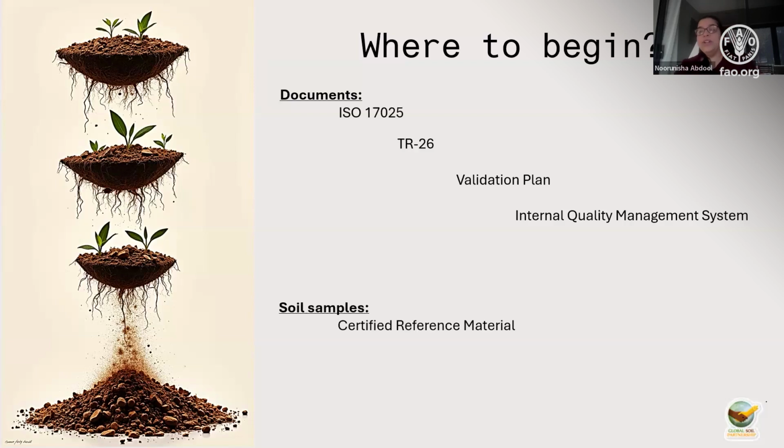Then, of course, you're going to need soil samples. Now, we touched on this a little bit where we use internal soil controls, or we have CRMs, or we have PT samples. I have a little star against internal soil controls because you can't just have a soil, mix it up and use it. You need to have a control that is stable.